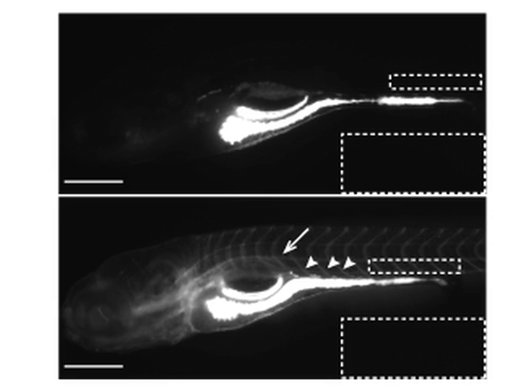This method can be used to deliver materials specifically to the intestinal lumen of zebrafish larvae, where transport within the intestine or in extraintestinal tissues can be studied.